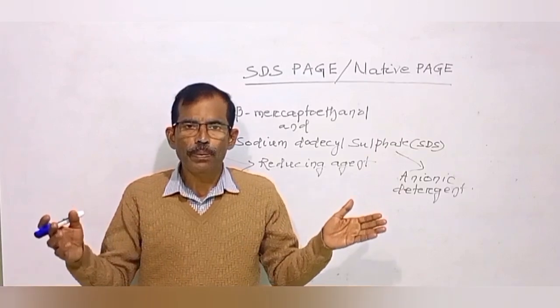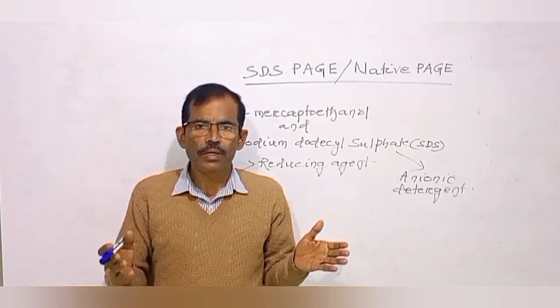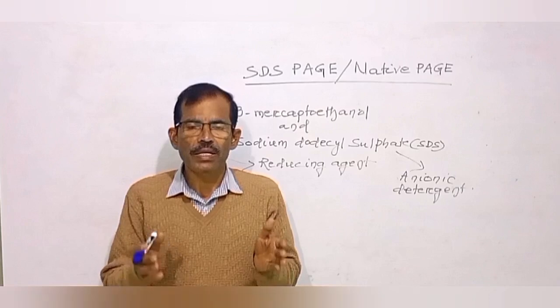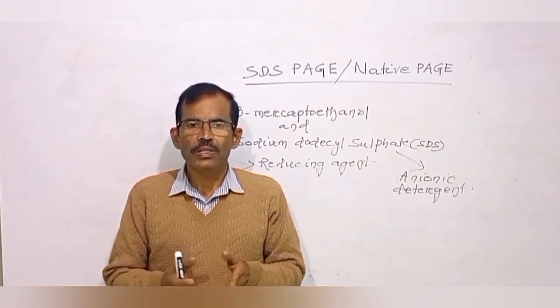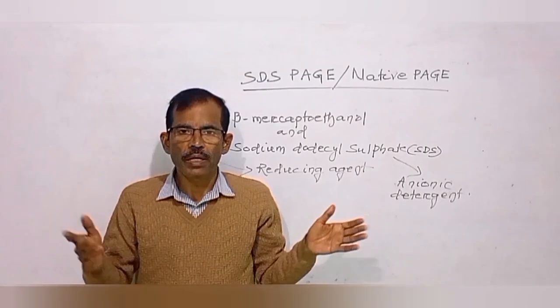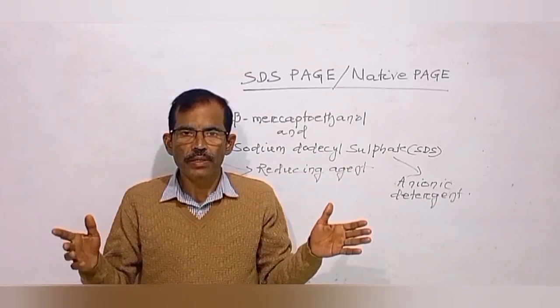Because the protein sample is deliberately denatured prior to electrophoresis, enzymatic activity and protein-protein interaction cannot be determined on proteins separated by SDS polyacrylamide gel electrophoresis. In addition, this technique is also not suitable for the detection of protein cofactors. All these shortcomings can be overcome by native polyacrylamide gel electrophoresis, also known as native PAGE.